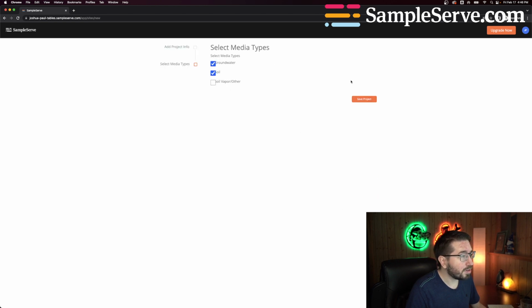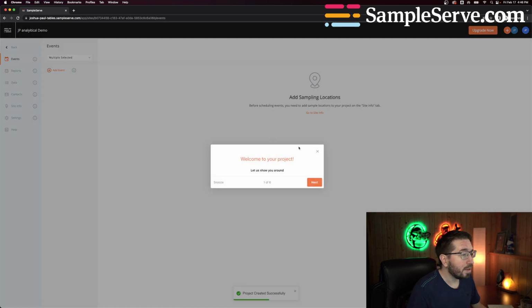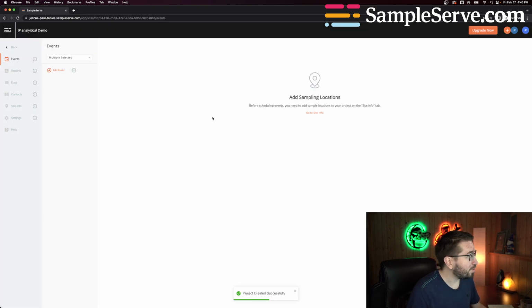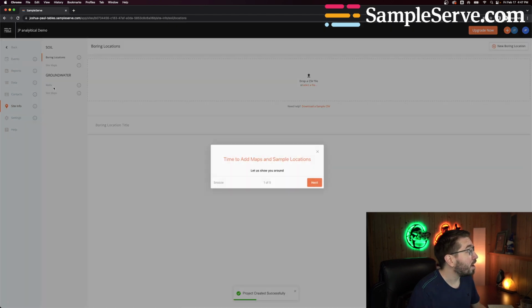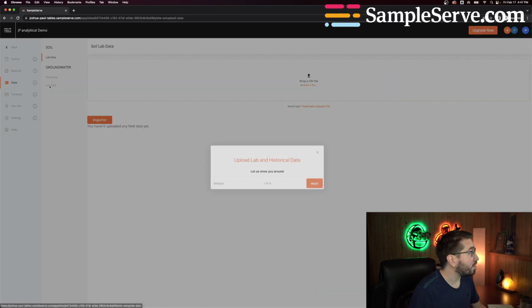We're going to grab our two media types, soil and groundwater. We're going to skip the tutorial. You can do that later. And under here, we have options to upload our project data. We can upload our site maps, and we can upload sample sites. We're going to start with lab data.